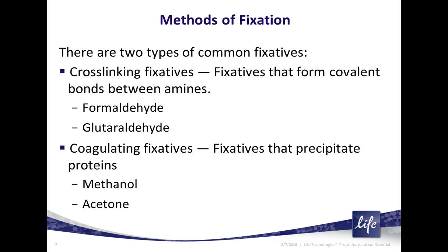Next, we want to look at fixation. So you take your cells, you remove the media, and you put onto it a fixative of choice. Now, probably the most common fixative out there is formaldehyde.